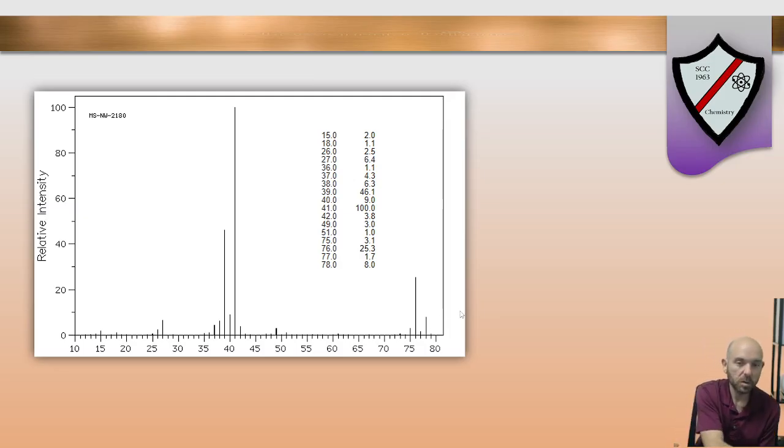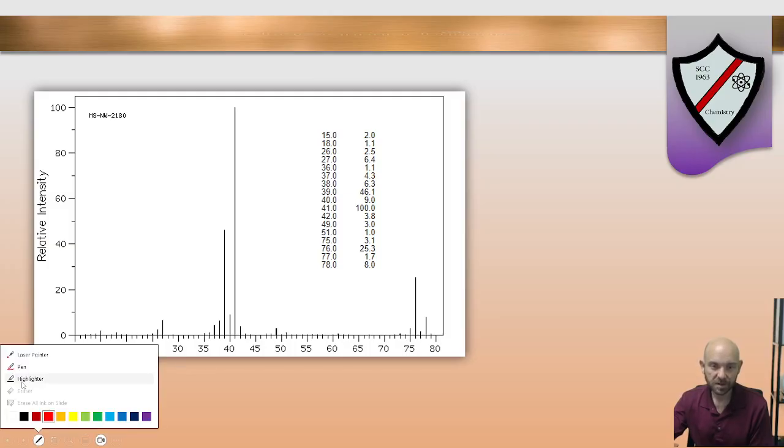Now, I do want to point out that once you involve a halogen, it screws up the percentages of what atoms are present in the molecule. So the estimation of how many carbons are there doesn't really work like it does when a halogen is not present.